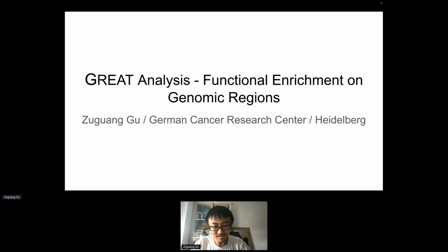Hello, everyone. My name is Zuguang Gu, and I'm from German Cancer Research Center, Heidelberg, Germany. And today I will make a package demonstration of the package called rGREAT, which performs functional enrichment on genomic regions.